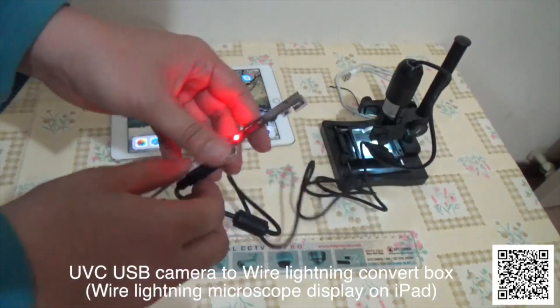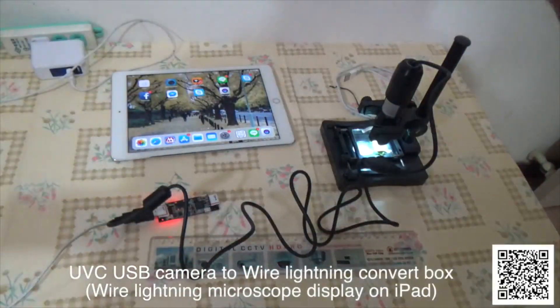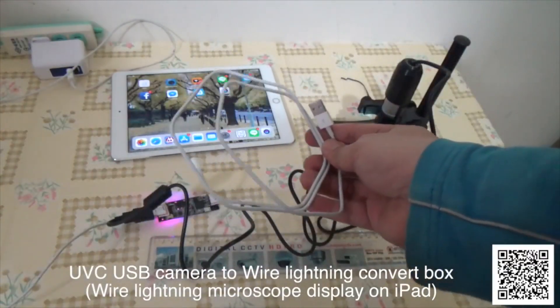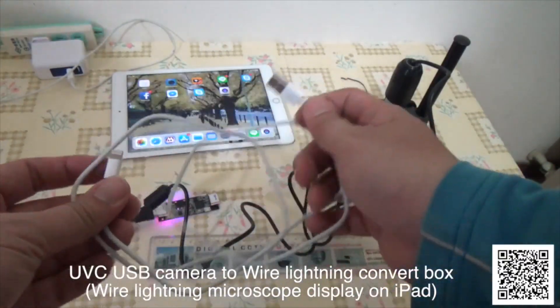Connect the power. This is a Lightning iPhone charge line — a Lightning USB charge line.